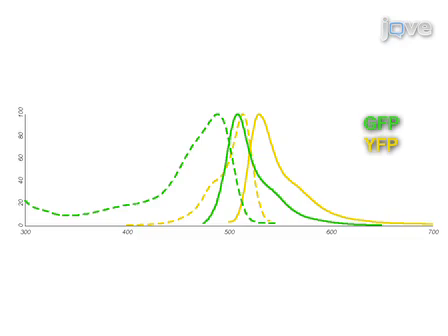When performing a multi-reporter imaging experiment, it is best to use fluorophores that are well separated spectrally. However, that is not always practical. Here we show a simple image subtraction method using the open source software ImageJ to separate fluorophores with overlapping excitation and emission profiles, in our case GFP and YFP.